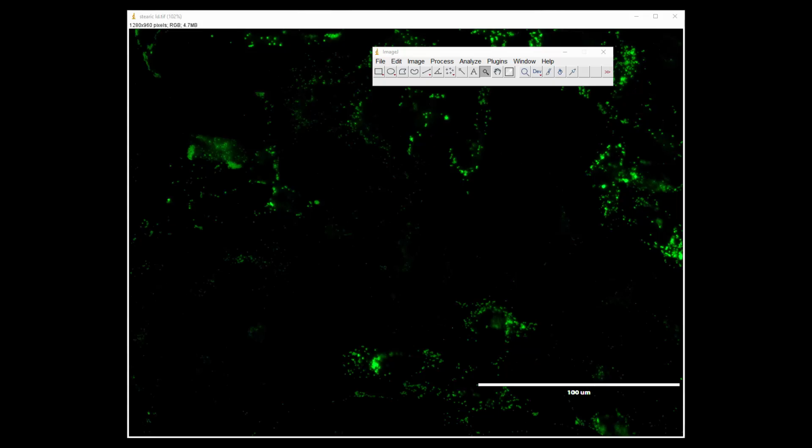All right, so in this video we want to look at how to quantify the number of lipid droplets per cell. Okay, so we're going to work with this particular image of lipid droplets. And the first thing you want to do, just like with the area, is you want to identify which cells you want to use. And sometimes finding the cells is really hard. So how are you going to find cells?